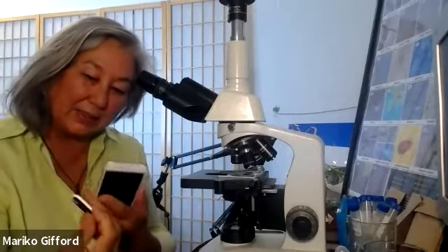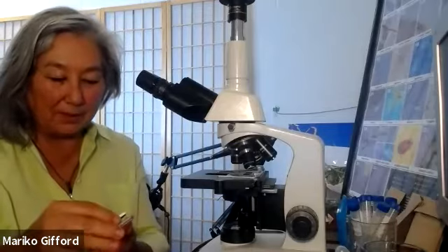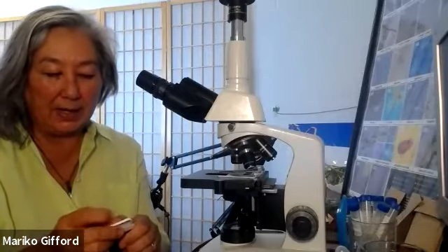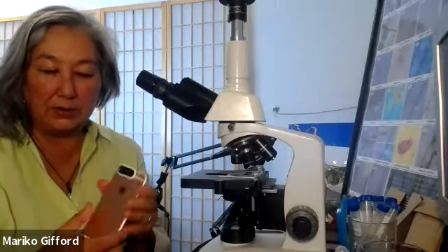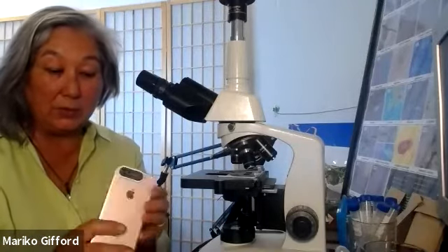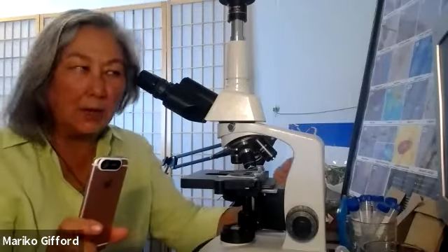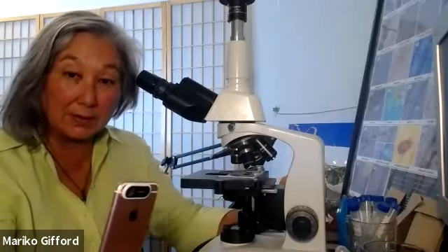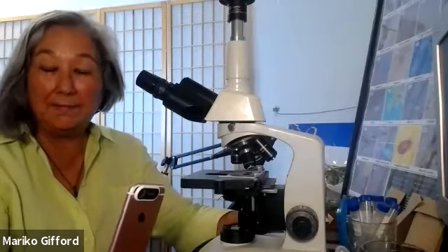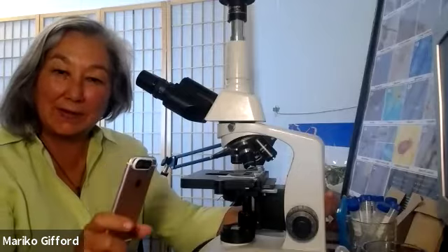and it has these little sticky things, and you turn your flashlight on your phone, and you have to download an app, of course, because it works with an app. And then you glue it to your phone lens of your camera. And now you can have this out in the field, and you can be looking at, now I believe this one goes to 1000 X. So much more than you need for microorganisms. You only need 400. So this is very handy.